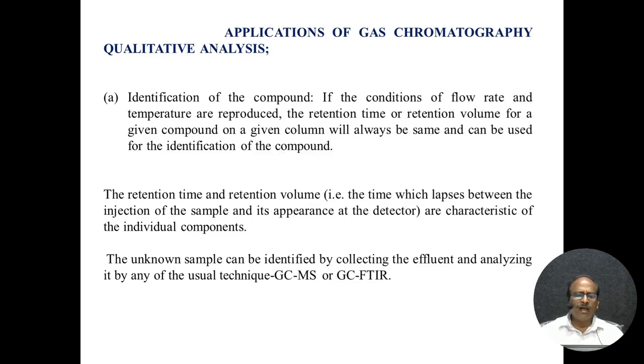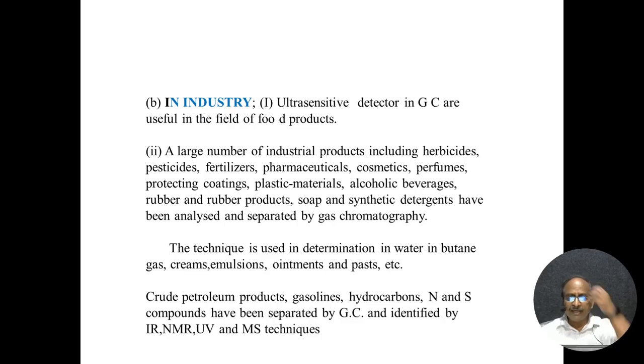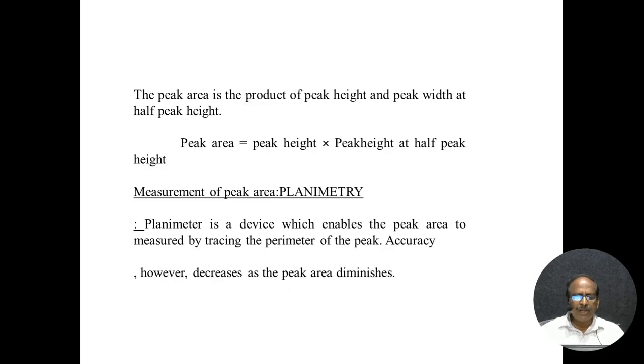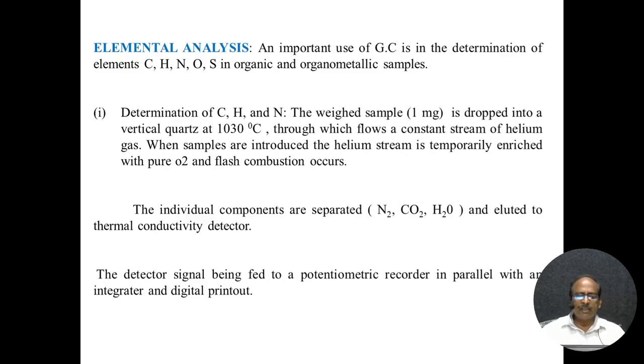The applications include qualitative analysis as well as quantitative analysis. In industries, ultra-sensitive detectors are useful, and quantitative detectors also give recorded chromatographic results. We have to use sharp, narrow peaks, calculate the peak areas, and then calculate the analysis.